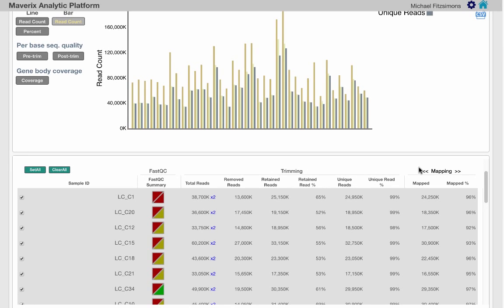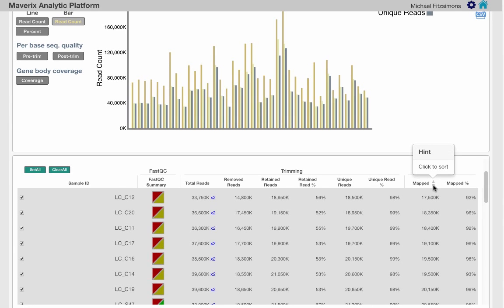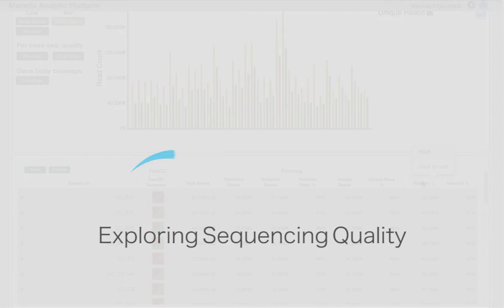This table can also be sorted by column, allowing you to easily find outlier samples for each output category.